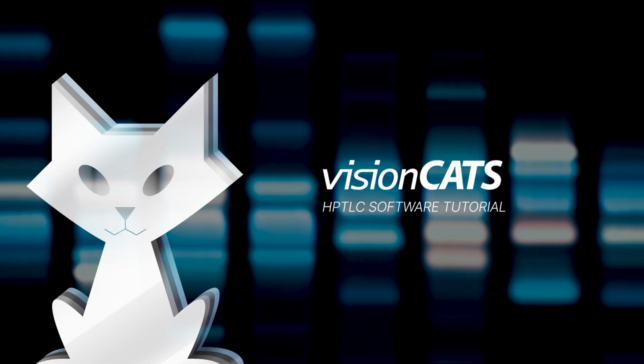Welcome! In this tutorial, we will walk you through the visionCATS Diagnostics feature, your central tool for monitoring system status and identifying potential issues.